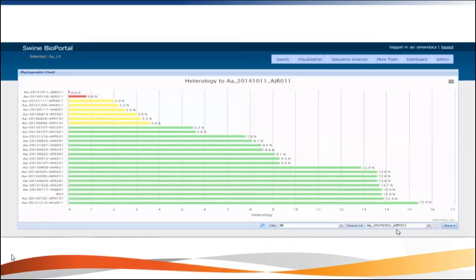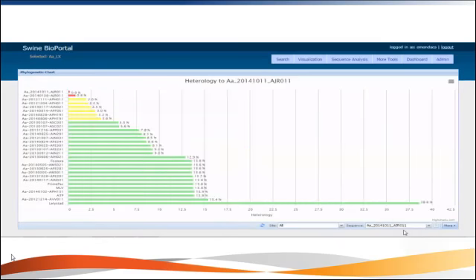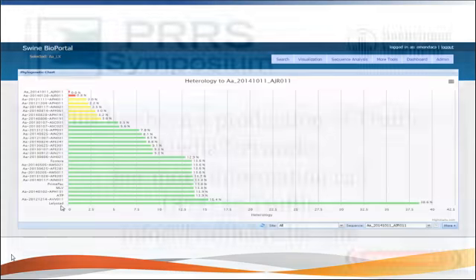and we will see what the distance is between that reference sequence and the rest of the information. Or maybe we can add some other reference sequences, such as ATP, Fostera, some other sequences we have available, and all that information will be included in our chart. Now, for this type of information, we can always see how these references compare to the sequence of interest.